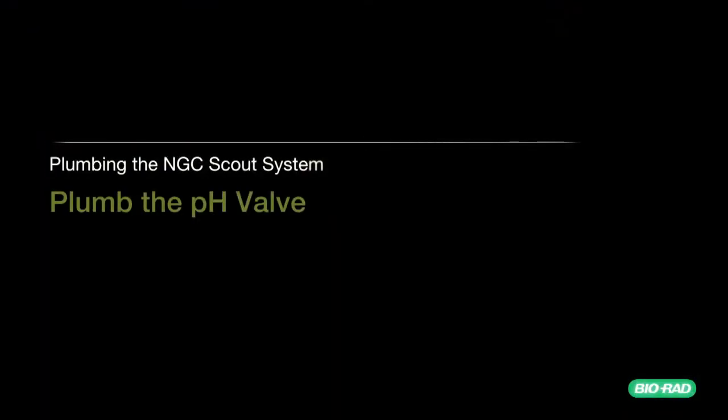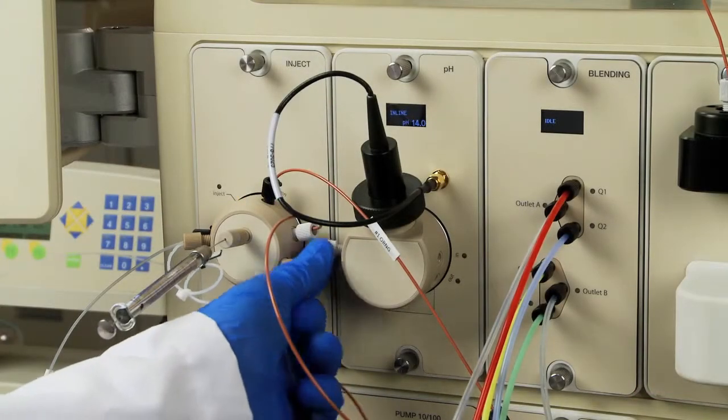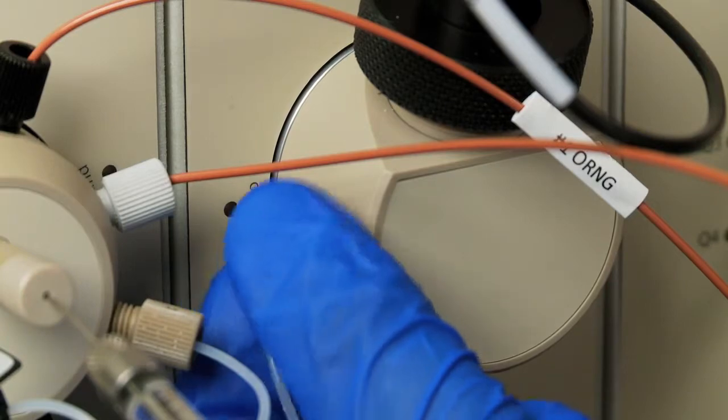Plumbing the pH valve. Connect a priming line to the calibration inlet port labeled CAL IN on the pH valve.